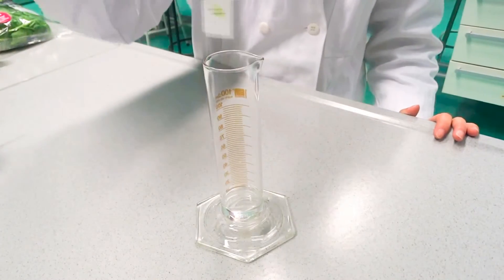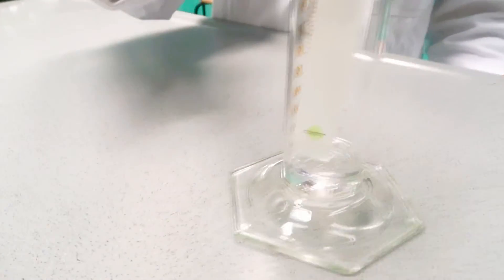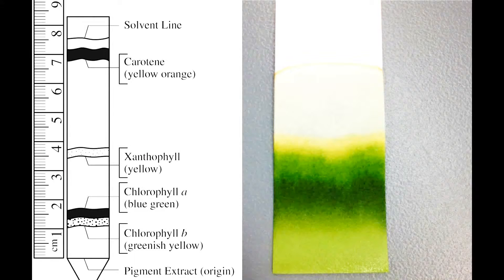Put the filter paper back into the glass and make sure it touches the liquid. If it doesn't, take the filter paper out and add more rubbing alcohol or water. When the pigments are nicely separated, take the filter paper out and let it dry. And voila, you're finished.